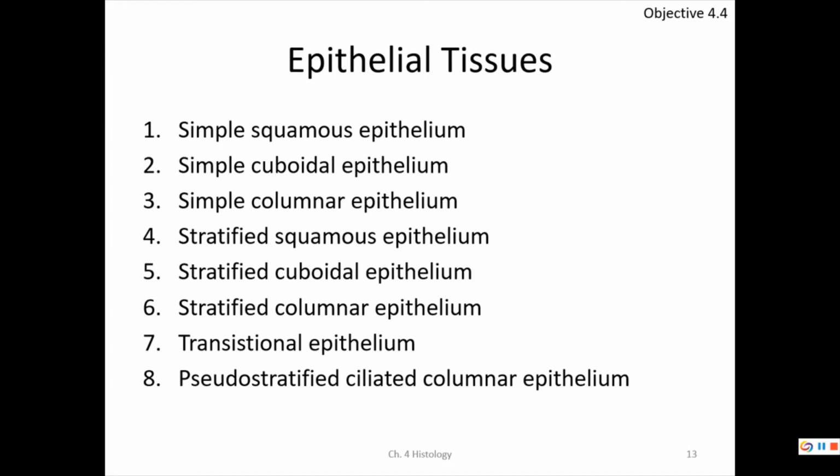Now that is the word that students first hit in A&P going, holy cow, do I have to spell that? Yeah, you will. It's always on my test. It's my favorite tissue because I just love saying pseudostratified ciliated columnar epithelium. It's like wacky inflatable arm-flailing tube men. It's just fun to say. Pseudostratified ciliated columnar epithelium. As we go through it, I hope you'll practice these and write these words out, because these are the tissues that we have to identify.